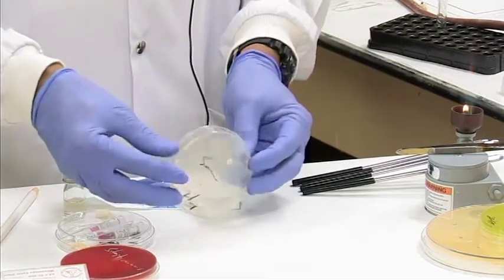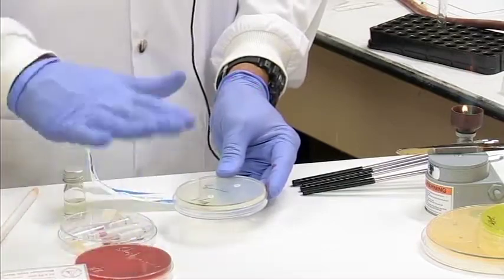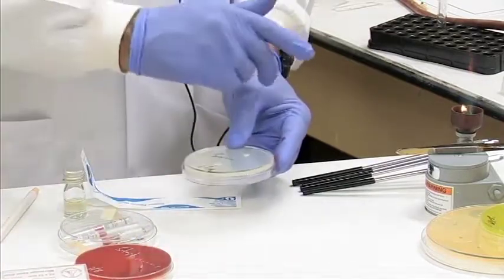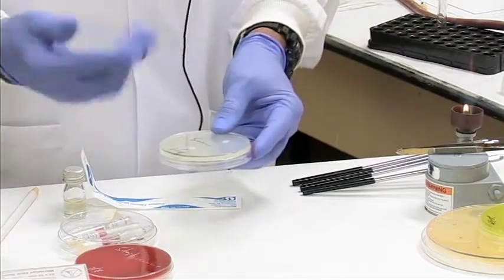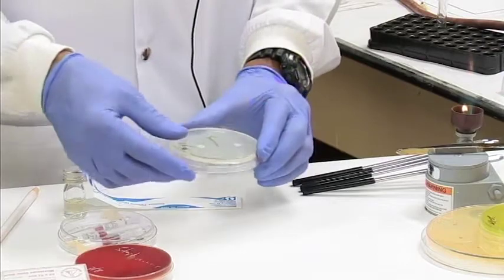So you want to invert the plate and incubate it with the agar on top. All plates are normally incubated in that fashion, with the agar on top. Simply, we will place this plate in our incubator again overnight, 18 to 24 hours of growth, and we expect growth the next day.